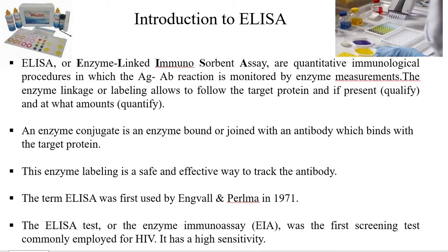Having the reactant of ELISA immobilized to the microplate surface enables easy separation of bound from unbound material during the assay. This ability to wash away non-specifically bound material makes the ELISA a powerful tool for measuring a specific analyte within a crude preparation.